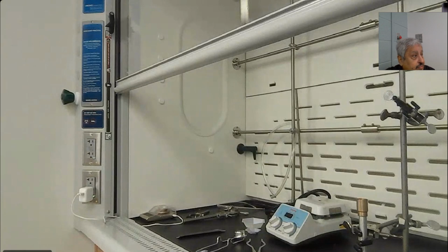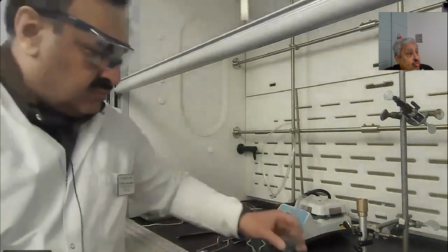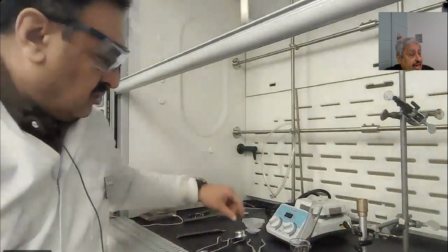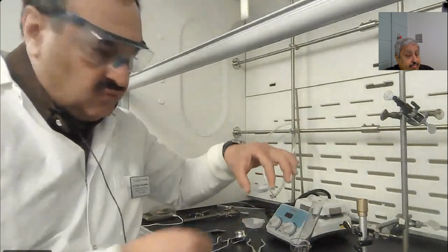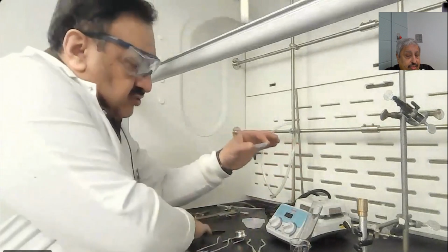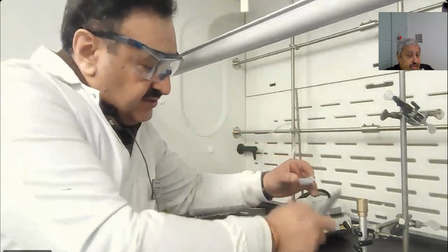Put the test tube in a beaker, right? The smallest beaker? Is that weighed prior to heating? No, you weigh them both at the same time, once it's empty, when it cools down. Yes, both. Weigh the beaker and the test tube. Both. 1 gram, we weighed 1 gram. And use the weighing dish, to weigh the material you have.